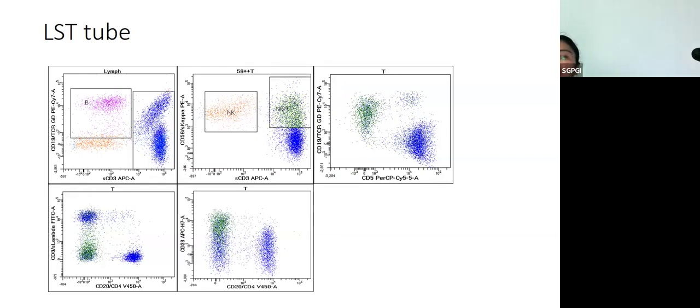If you have a look at the tube, you realize that 19 versus 3, you have your B cells nicely, you have your T cells. And what are these cells? The gamma delta T cells, right? They appear to be increased in number and they appear to be more than usual, right? So now the other gating strategy is we exclude the P and now we pick up the NK T cells. The minute we do that, we realize that the gamma delta cells are expressing CD56 as well, right? So that is the pattern that comes up.